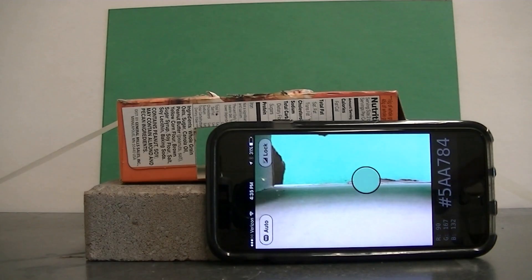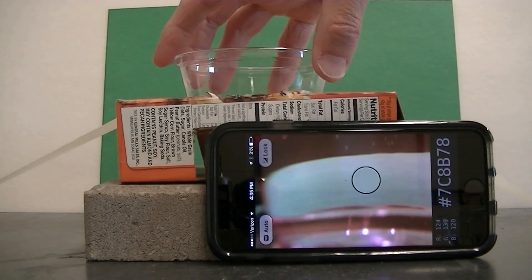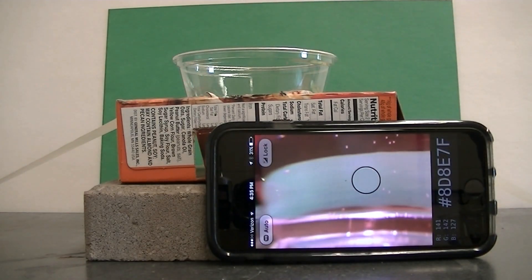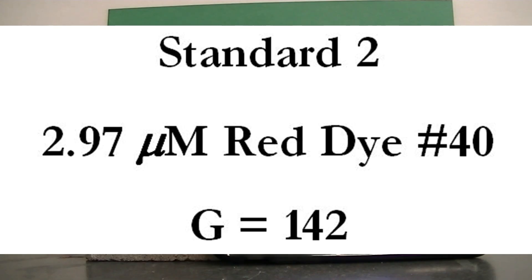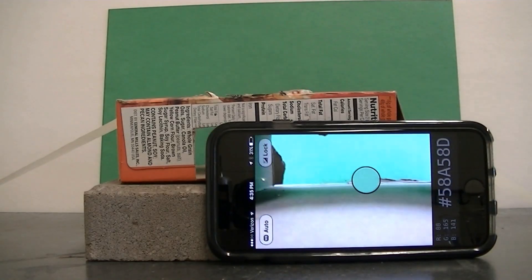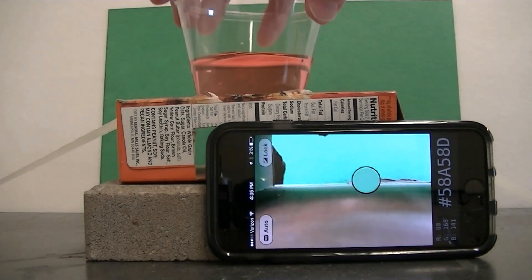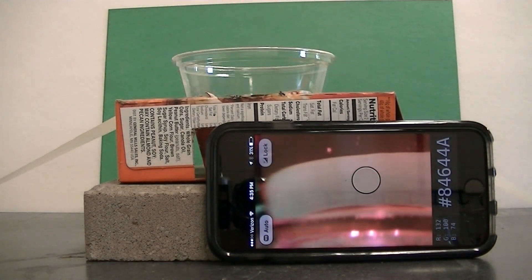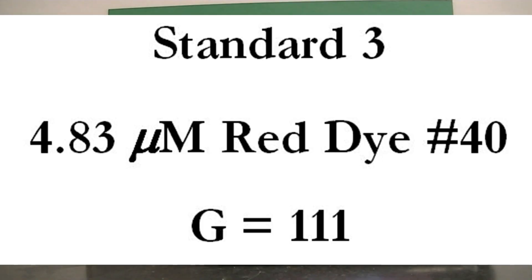My next sample has a concentration of 2.97 micromolar and the corresponding green value looks like 142. So it looks like a little more of the green light gets absorbed which again we'd expect. Now we're going to move up to 4.83 micromolar. And my green value has dropped to 111.